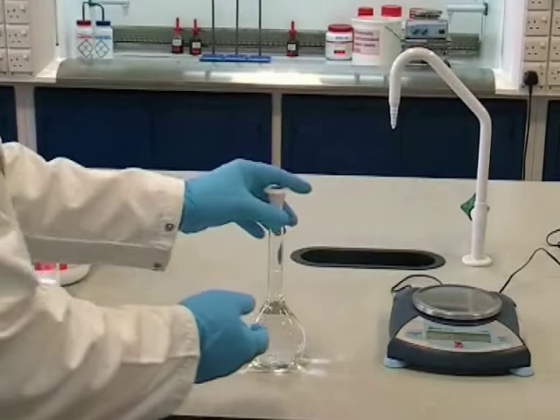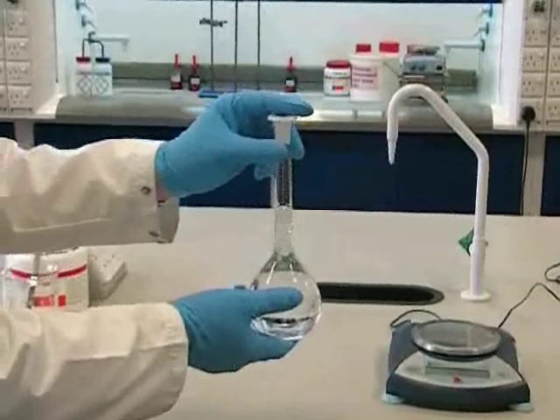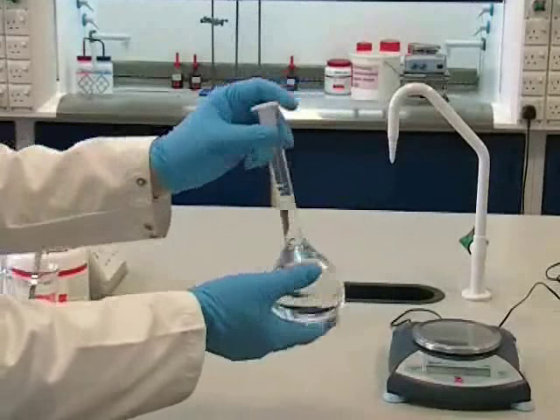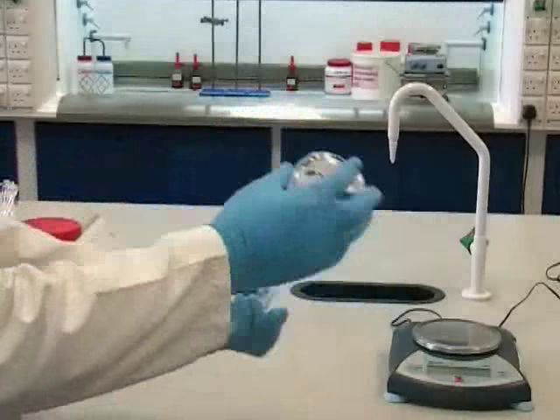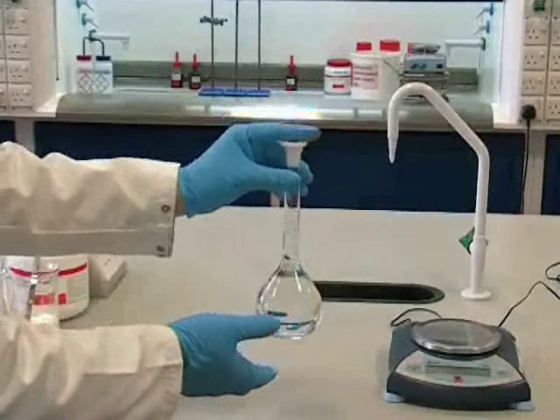Once the solution is made up, it should be stored with the stopper firmly in place. And before using the solution, you must ensure that it is homogeneous, which can be done by gently inverting and shaking the flask. We now have a standard solution which is ready to be used in a titration.